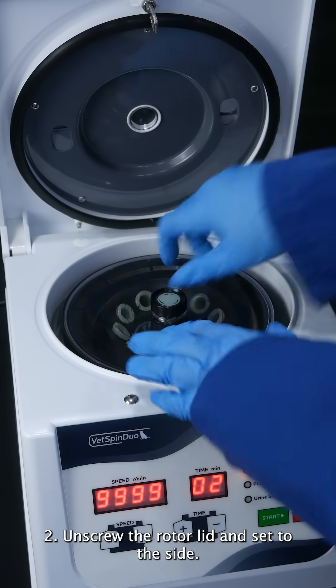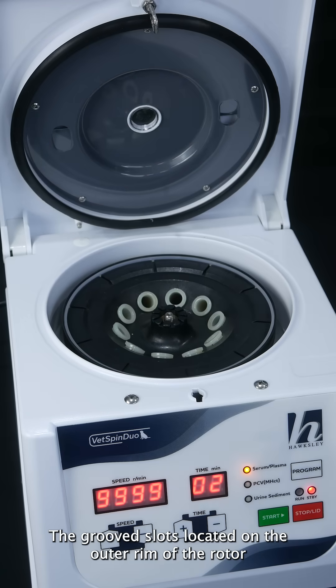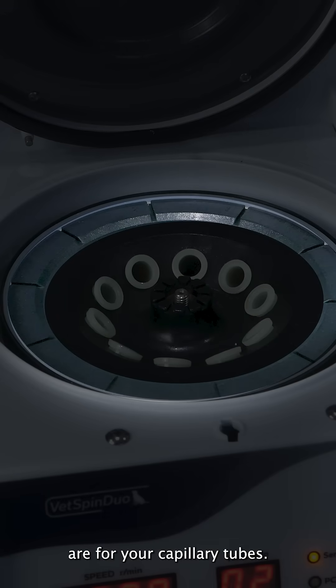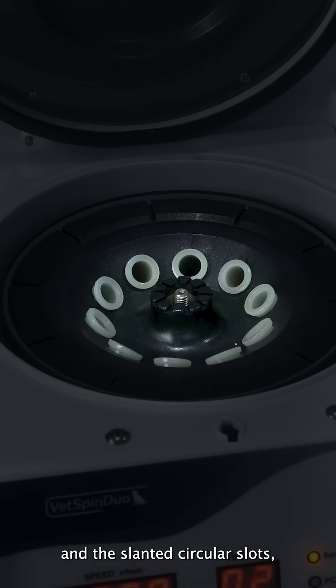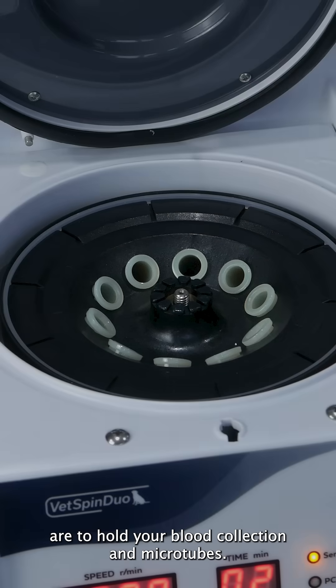Unscrew the rotor lid and set to the side. The grooved slots located on the outer rim of the rotor are for your capillary tubes, and the slanted circular slots, located on the inner circle of the rotor, are to hold your blood collection and microtubes.